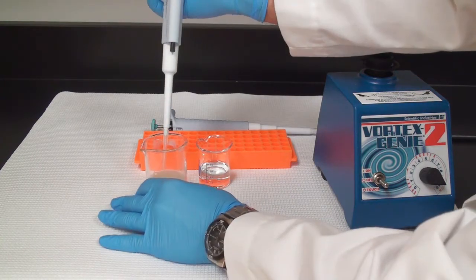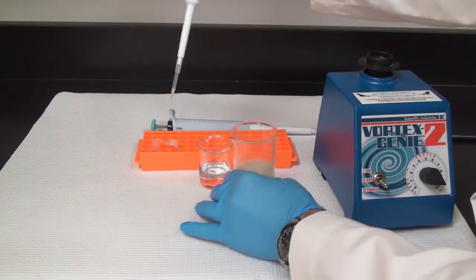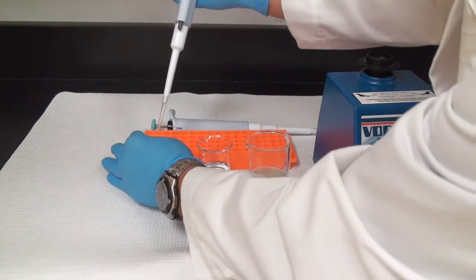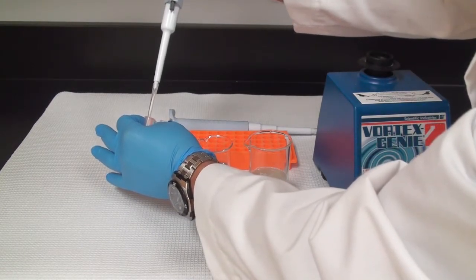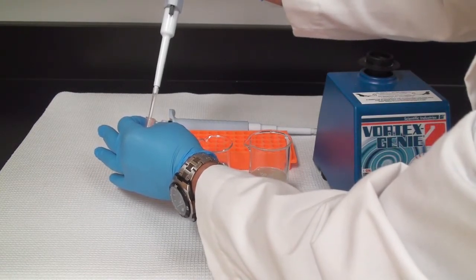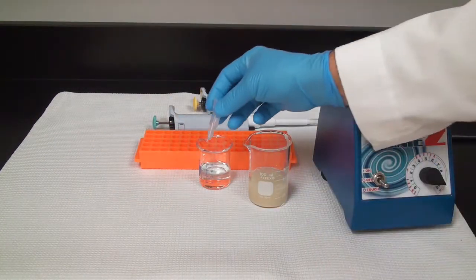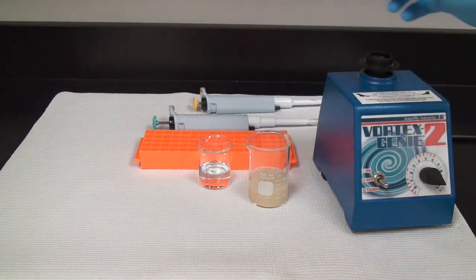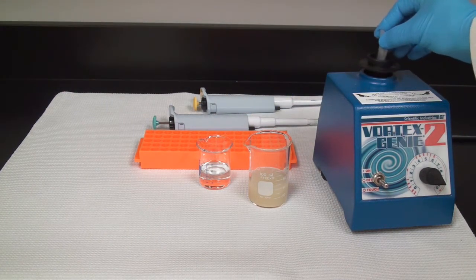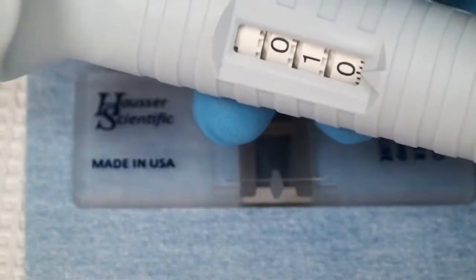Mix that up to make sure that they're all in suspension, and then add that to the buffer or dilution. Cap that, and do a little vortex to make sure all of our cells don't get concentrated at the bottom and are all mixed up. Now I'm ready to load the hemocytometer.